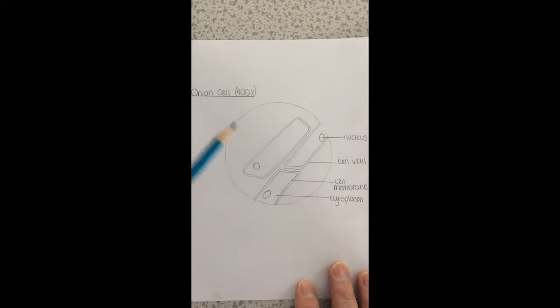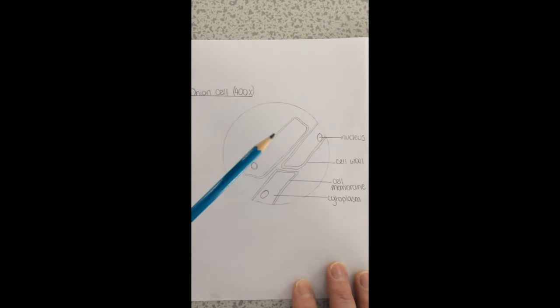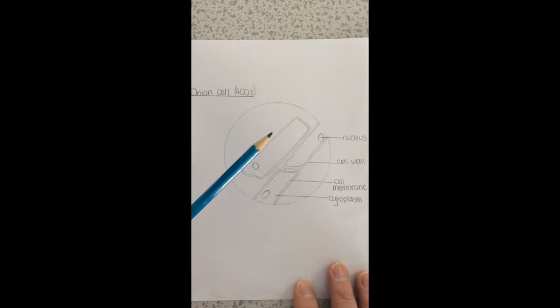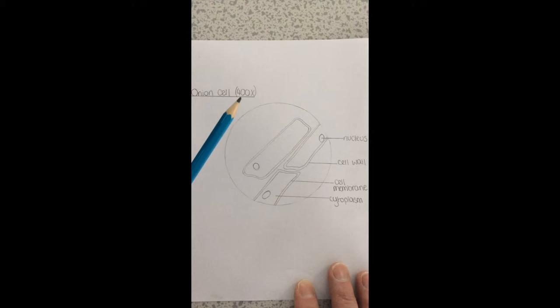Here is my microscope drawing, my scientific label drawing of the onion cell that I viewed under the light microscope. And you can see I've identified and labelled the cell features that I could see. So you've got the nucleus, the cell wall, the cell membrane, and the cytoplasm. And the total magnification was times 400.